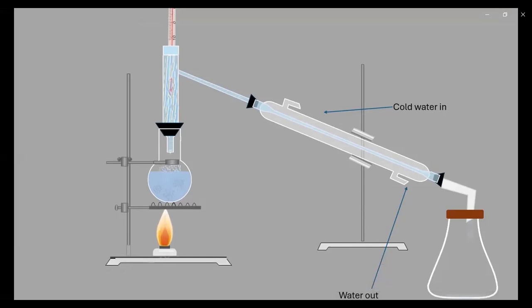So let's watch. You see that something is falling back into the container. That is a depiction of a little of the particles of the second liquid that went into the fractionating column. The boiling point is not yet reached, so as it gets into the fractionating column, it falls back into the container. The other one with the lower boiling point continues its journey as gas and eventually gets into the condenser, then turns to liquid inside the condenser and falls into the conical flask to be collected as a distillate. So that is fractional distillation in action.